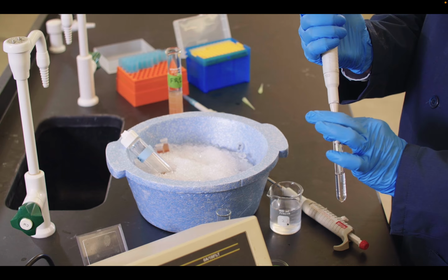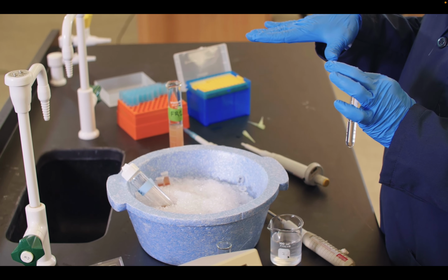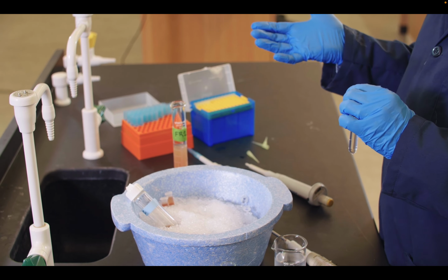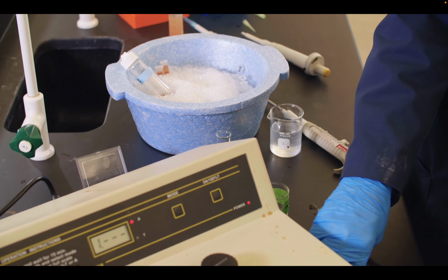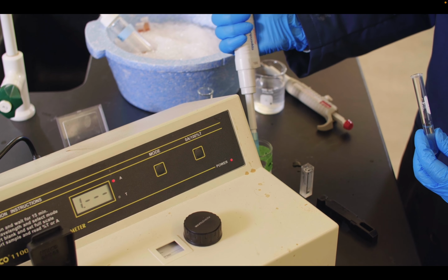And again, this is a dilution of our FR1, and remember we diluted it 1 to 160. So 1 microliter of the fraction 1 supernatant, and 159 microliters of buffer, to help dilute it out because GOT is fairly concentrated at this point. All right, so this test tube is about ready to go. However, the one thing that still needs to be added is the alpha-ketoglutarate. We're going to add this, put it into the spectrophotometer, and start a 4-minute timer.